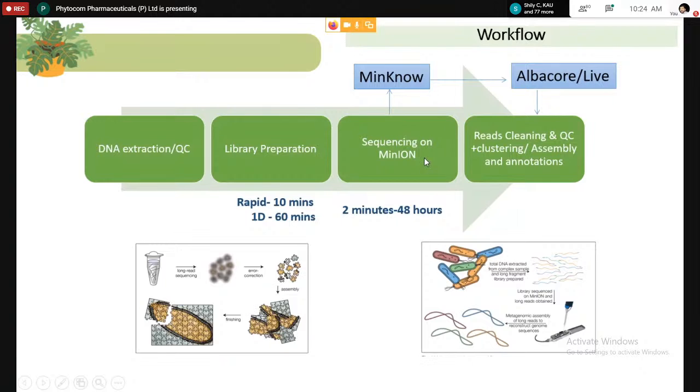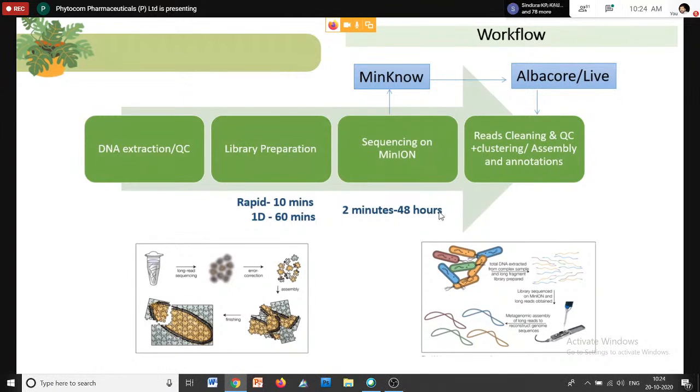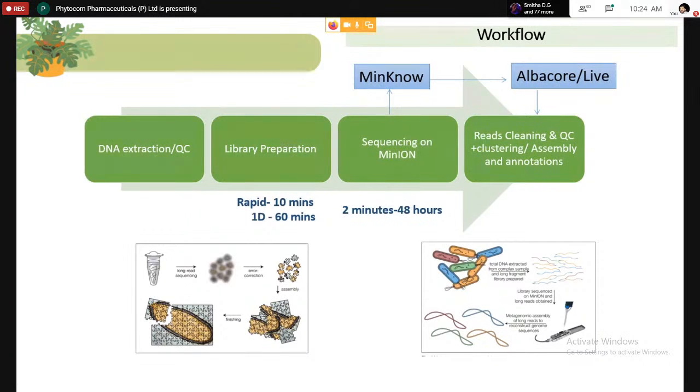In the case of the MinION, if you are loading 750 nanograms of library into the flow cell, you have to sequence for 48 hours so that your entire sample will be sequenced. And from 2 minutes, you will get data. Suppose you are using a control DNA like lambda phage, and you have included lambda phage in this library. After 2 minutes, if you do base calling, you can see the lambda DNA fully sequenced. So that is the advantage. You know the size of lambda is around 47 kb. It is impossible to get a 47 kb sequence in 2 minutes in an Illumina machine. So in a short time, a longer read will be sequenced in nanopore.